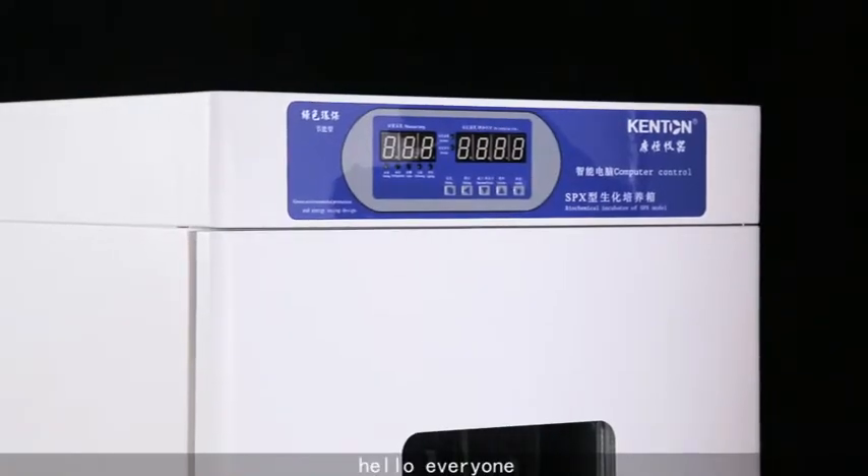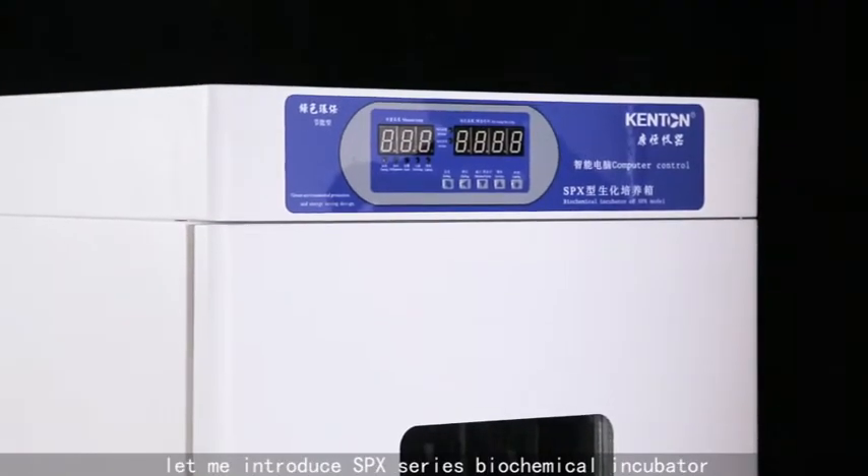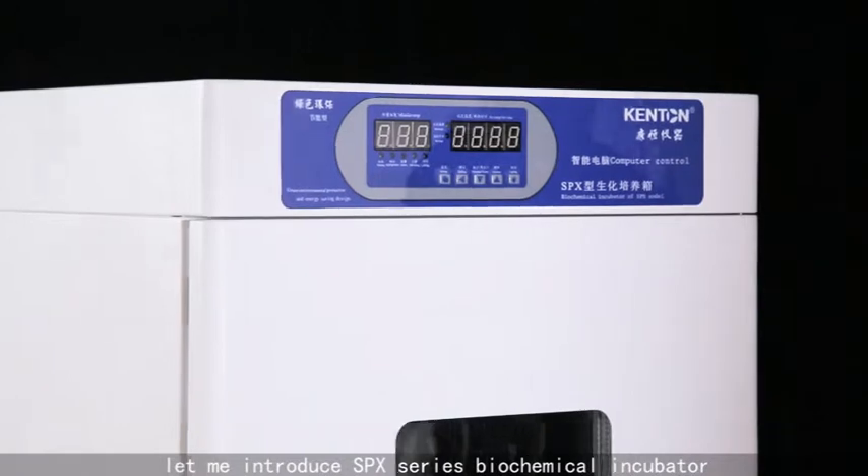Hello everyone, let me introduce the SPX series biochemical incubator.